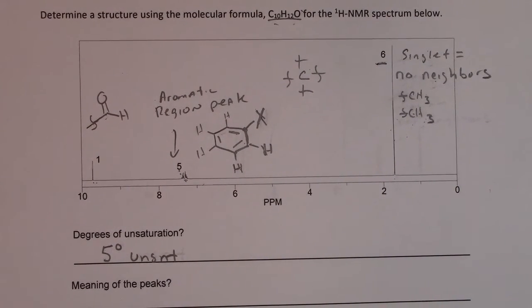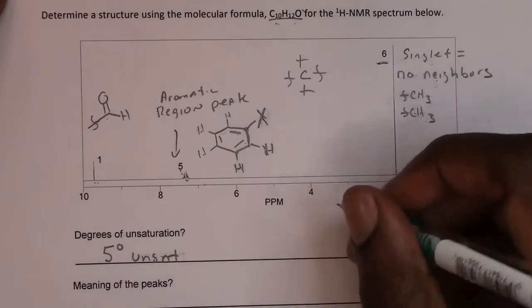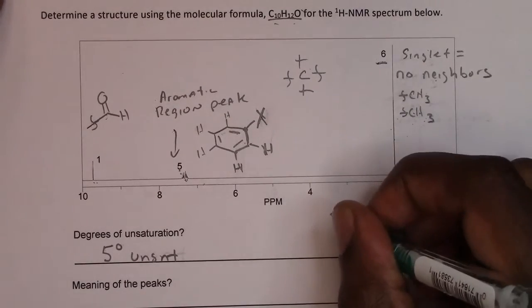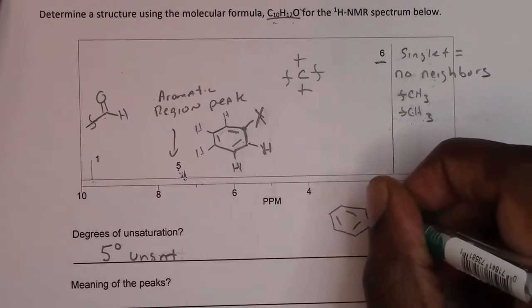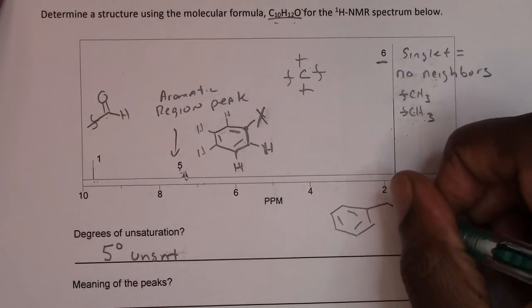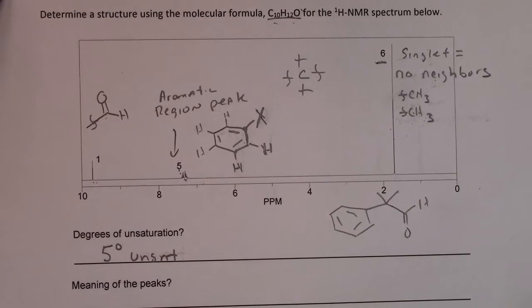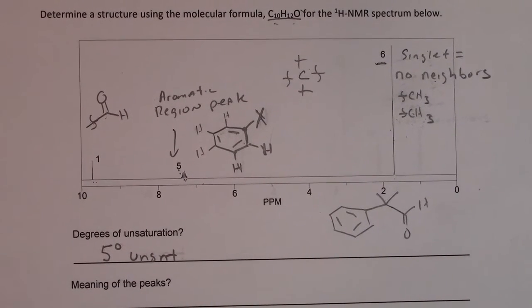All right, so hopefully you guys have taken some time to see if you can piece this structure together. And so I'm going to go ahead and draw the structure of the unknown out. This corresponds to the structure of your unknown.